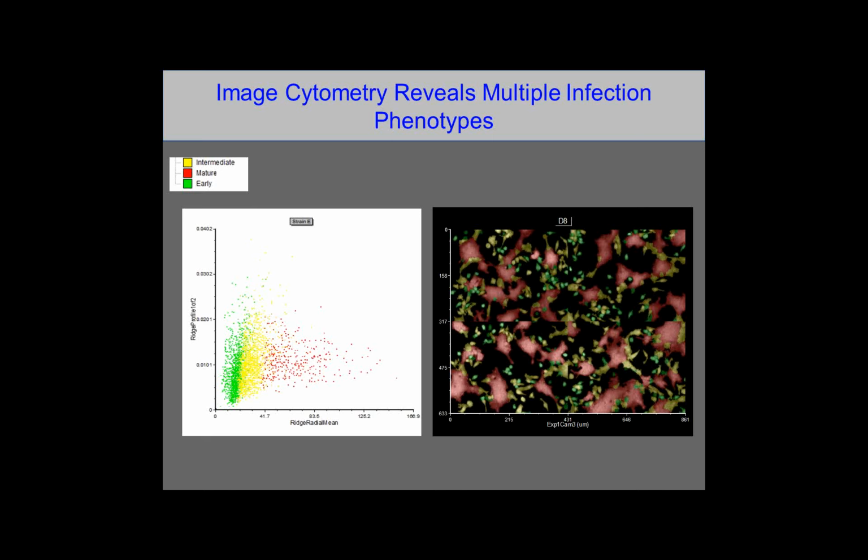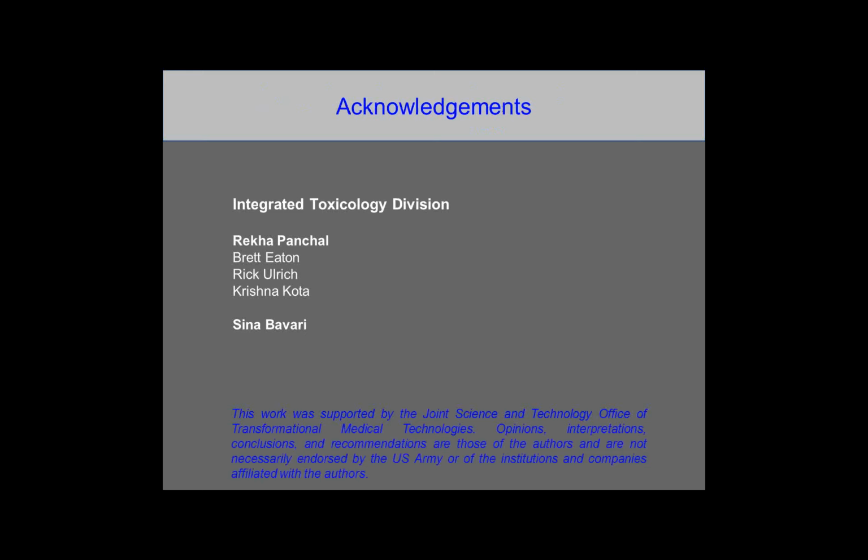So this is just to give you an idea of what we can do with FCS Express 4 and Acapella generated data. So with this, I'll end it here.